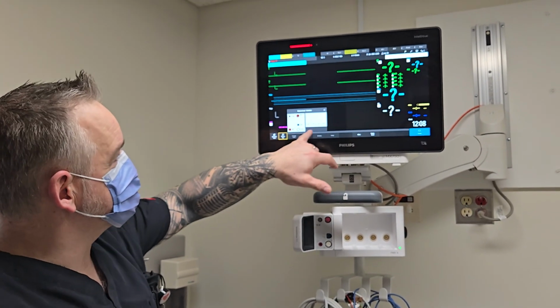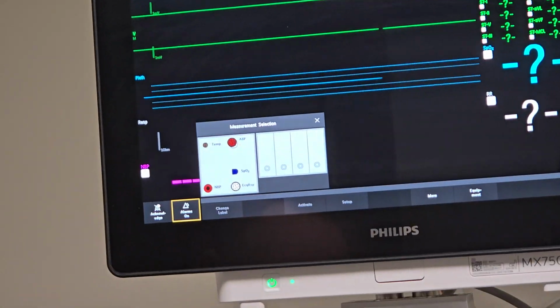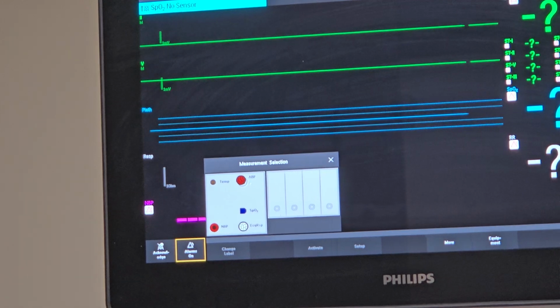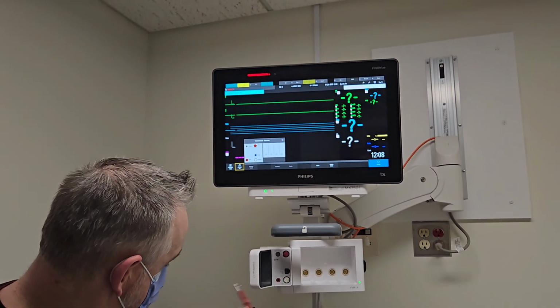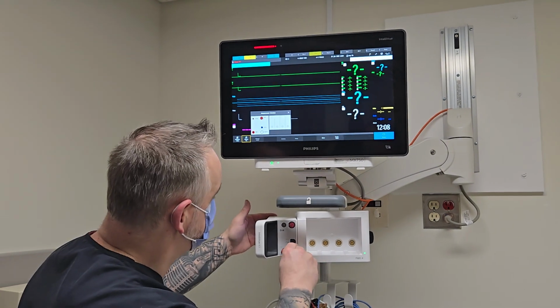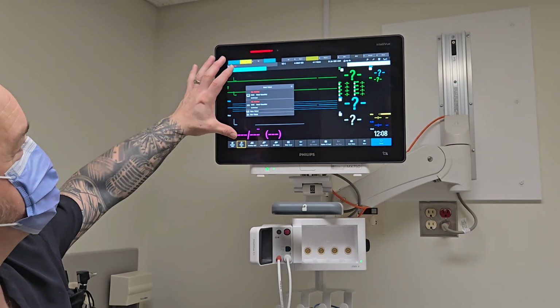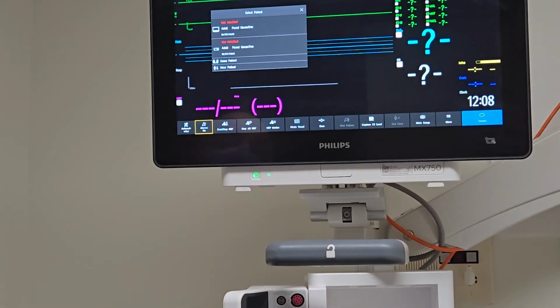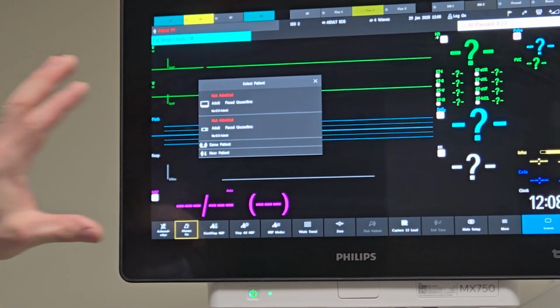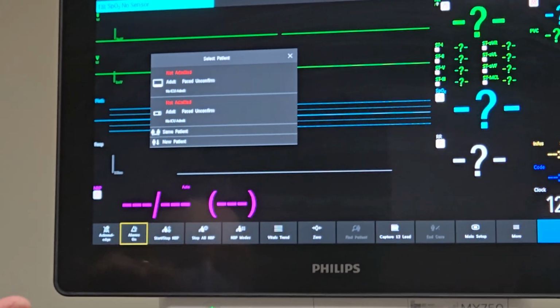So this little screen here, because I have nothing plugged into the box that's giving me the screen, it's not happy with me. Normally, if I had all the adjuncts plugged into it, it wouldn't have given me that message. But if it does, you can ignore that box. This is the box that counts. Okay? So this is the box that has confused us over and over again for a long time.